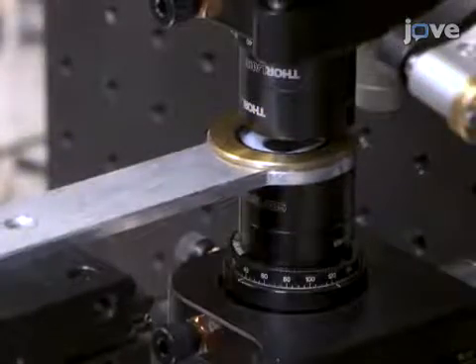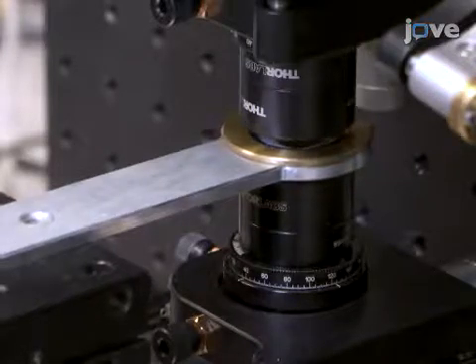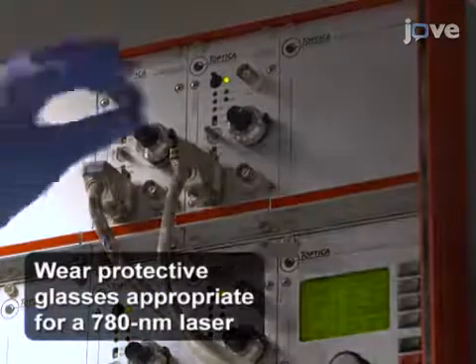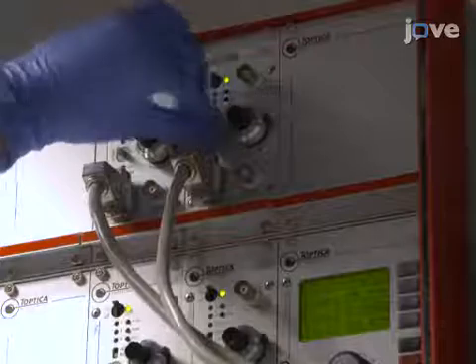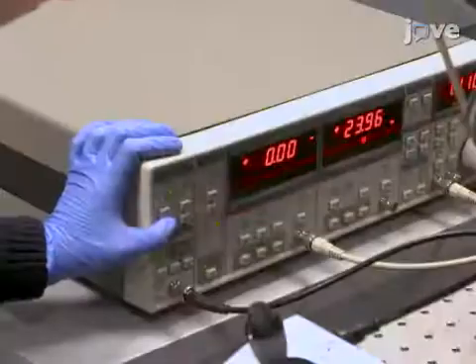Translate the sample to the common focus point of the probe and pump focusing lenses. Then, adjust the current knob of the tapered amplifier pump laser controller until the pump laser power is above 250 mW. Set the lock-in amplifier time constant to one second.